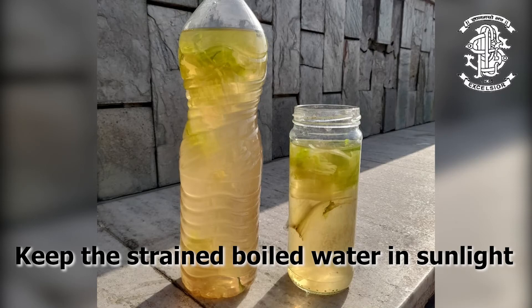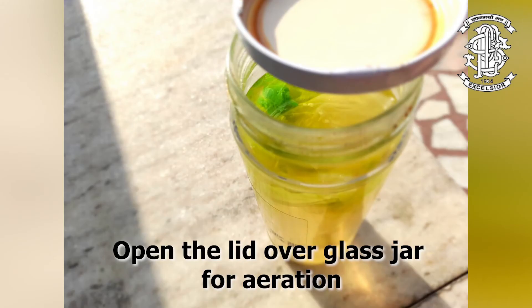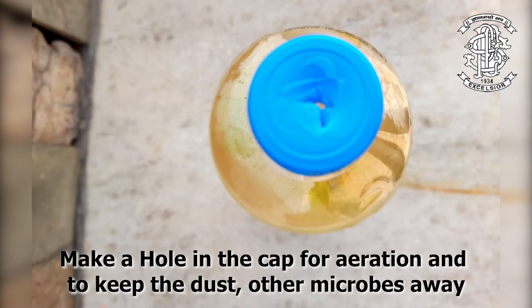Before you keep it in the sun, make sure that you leave some room for aeration, just to ensure that air is circulated. Now, shake the bottle and keep it open, or make a tiny hole on the plastic bottle cap, just like I did.